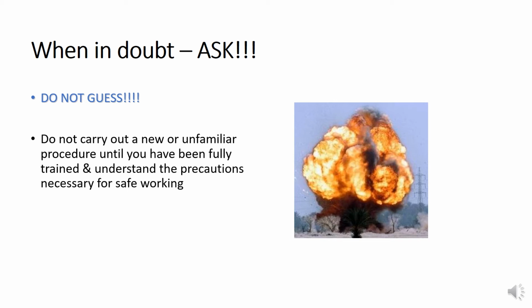This slide is very important and you should never forget about this slide. Once you are in doubt, I mean you are not sure about the chemicals you are going to use, and you are not sure what the function of this chemical is. If I mix these two chemicals, what is their effect, what will they do? Then please don't use that chemical.